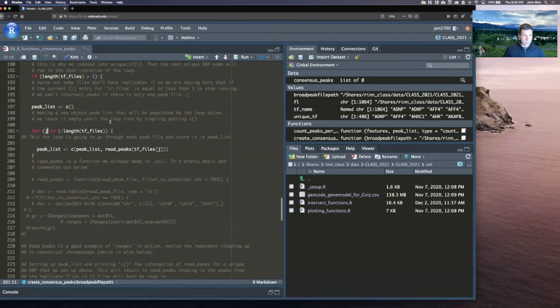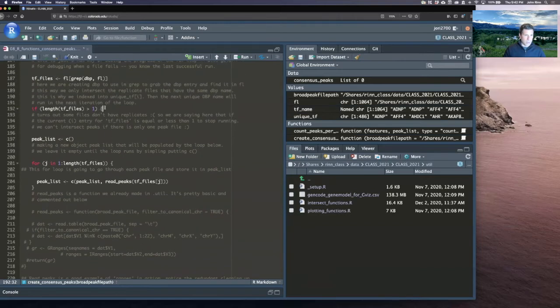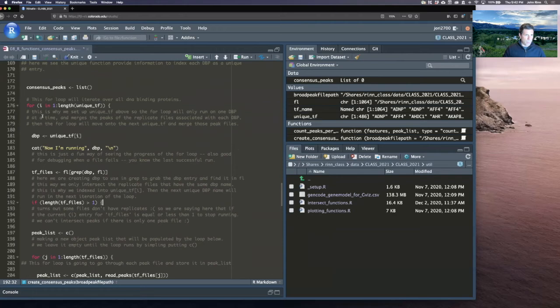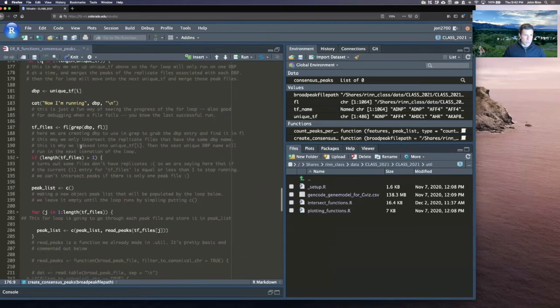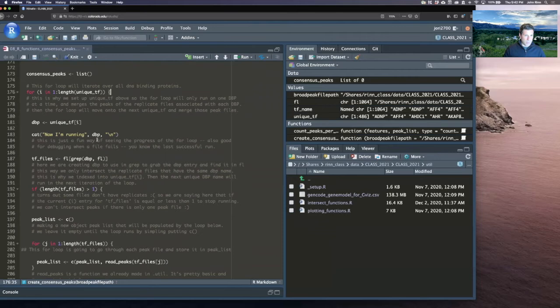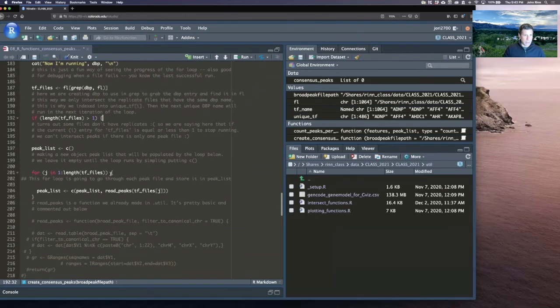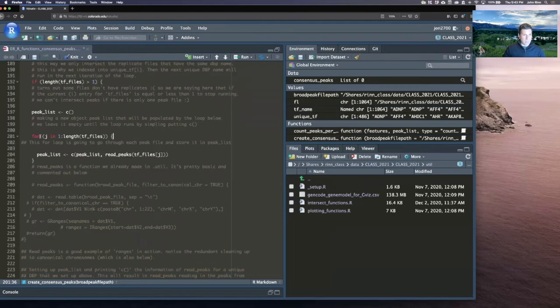Okay, so this is where it gets tricky, and why I was pointing this out up here: we already started a for loop for I. And now, in that same loop, we did that, and now we're doing something below that, and now we're going to do something else in here. So what's happening is we're running what's called a nested for loop.